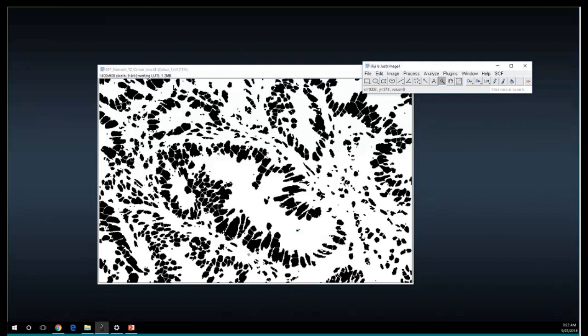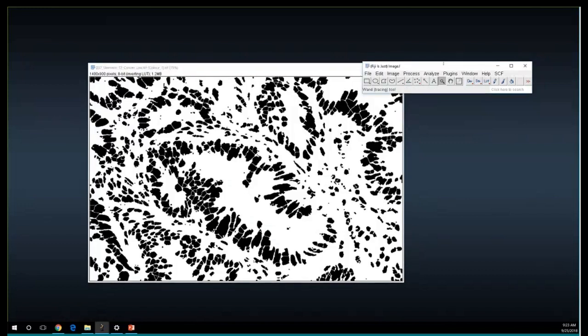And the reason I said to get rid of all the holes within the nuclei is important, because sometimes if you look at the nuclei here and you ask yourself why the algorithm segmented it this way, although this is one cell, it's because there were some holes within this nuclei. So that's why it's important to have a clean image.